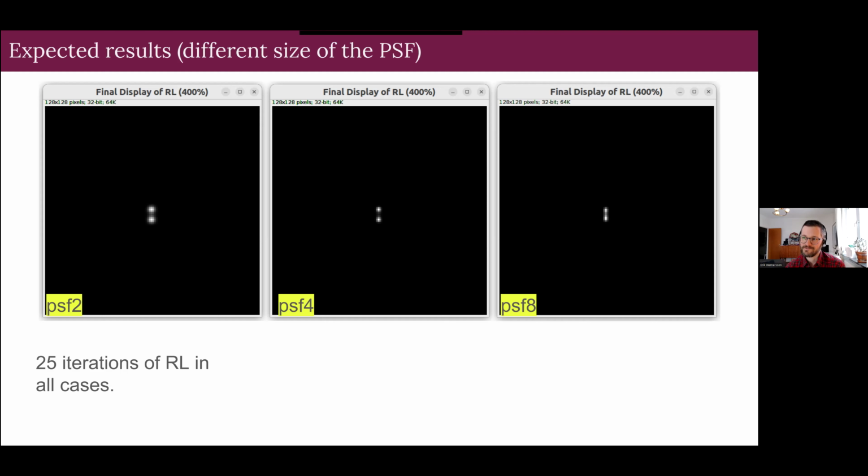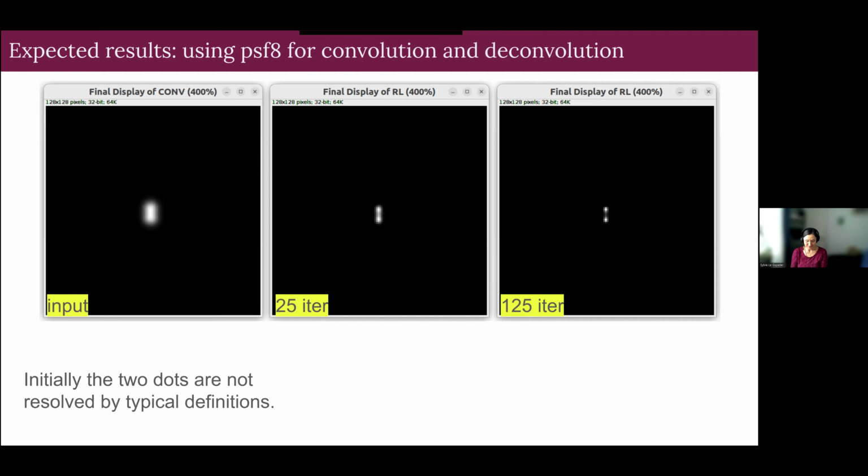So you're getting the images basically, and then okay, I understand. And the latest problem we had with our scope was that there was a sample holder that was loose and blocked part of the light, so all images were dim on one side. So there's always something that can be problematic. So that would be very interesting. Maybe we should take 3 samples on the slide and compare them after deconvolution. Maybe we will really understand. I think that would be pretty cool. Yeah. And another thing you can do, if you deconvolve, then you can convolve again with the PSF and see how different it is.